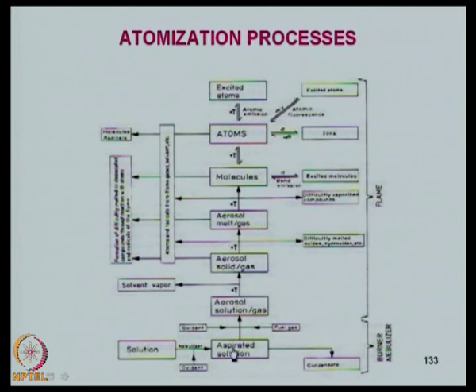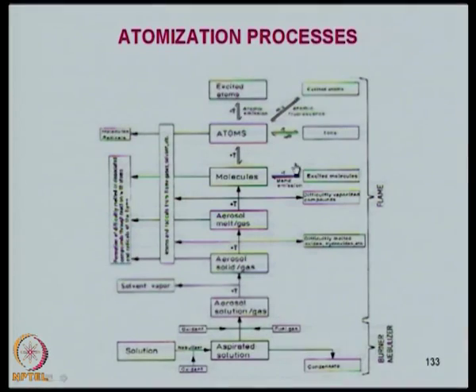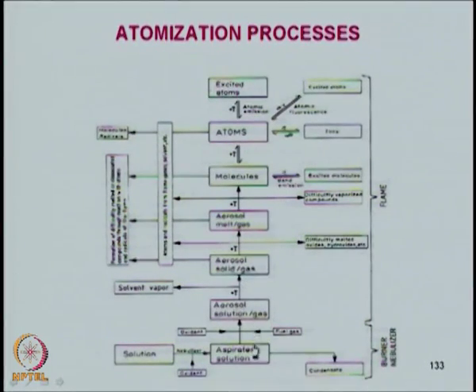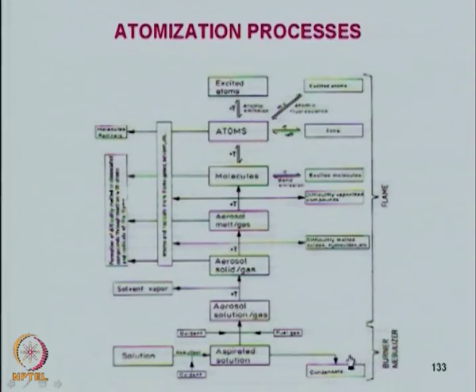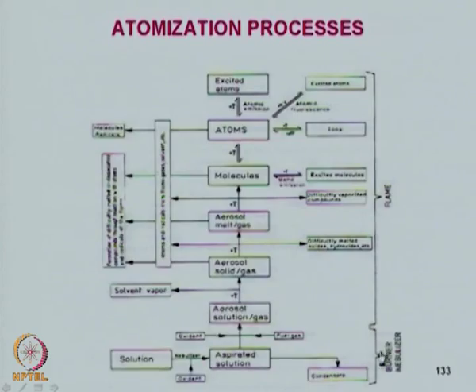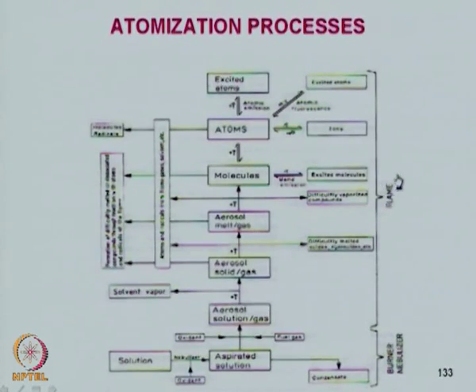Now, this is a process for which I have prepared the different stages of atomization. Here you can see that on this side I have put the burner nebulizer, and here I have put the flame.